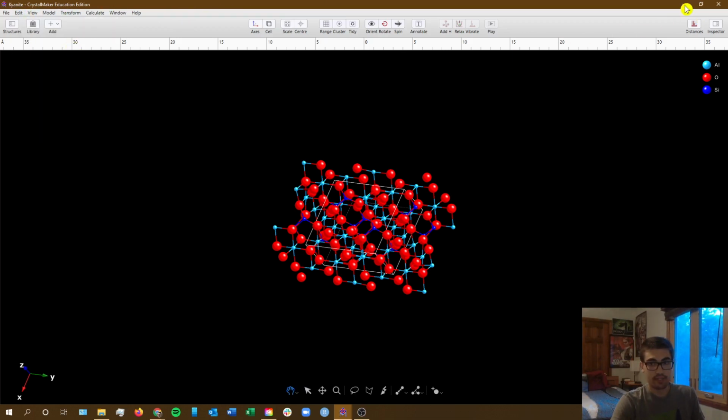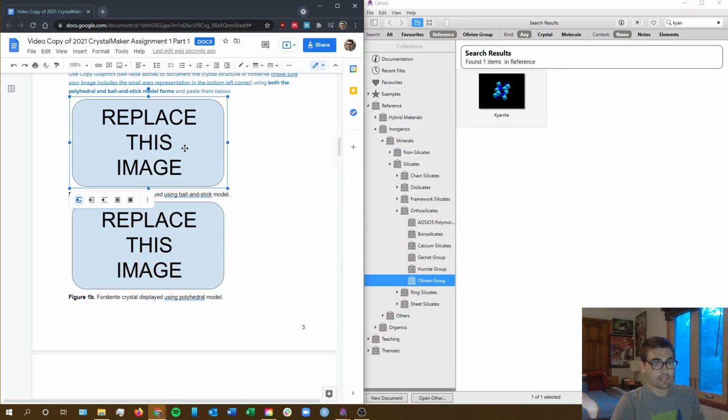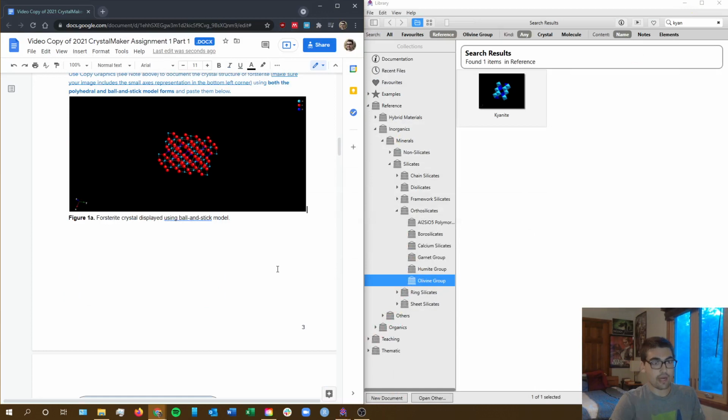So copy graphics, and then we can minimize, click on the image again, copy paste, and now it's nice and wide. So I would recommend doing it this way. I had it open sort of tall to keep both of these on the same screen, but you want to do this sort of long ways, like I have now. Okay, so we've done our first assignment.